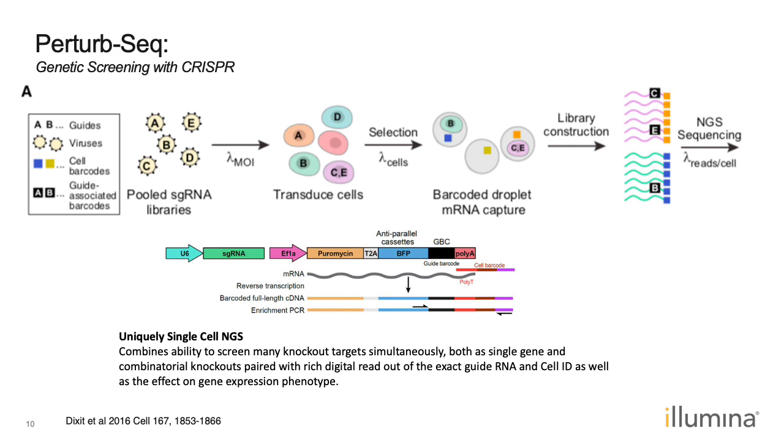And so this allows you to not only identify that perturbation, but to also look at how this particular knockout is affecting the global gene expression phenotype of that particular cell, which can then help us better understand why our particular knockout is behaving a certain way, whether that be resistance or sensitivity to our experimental conditions.